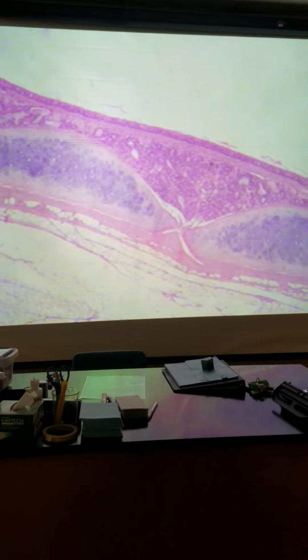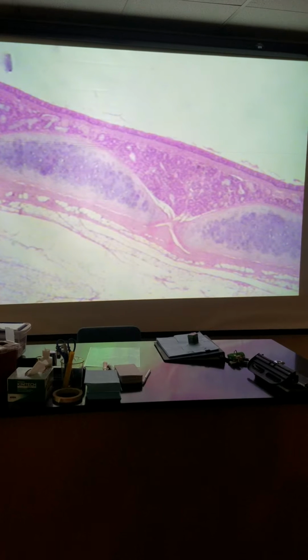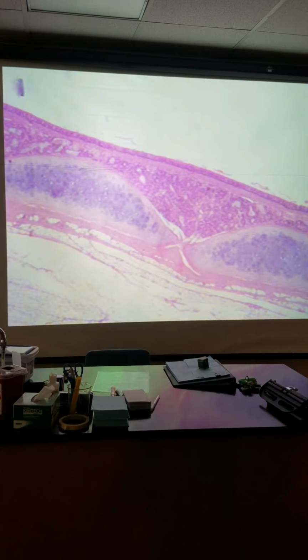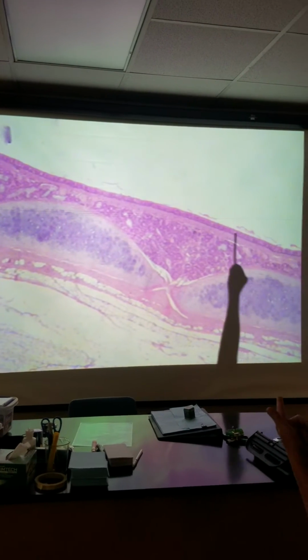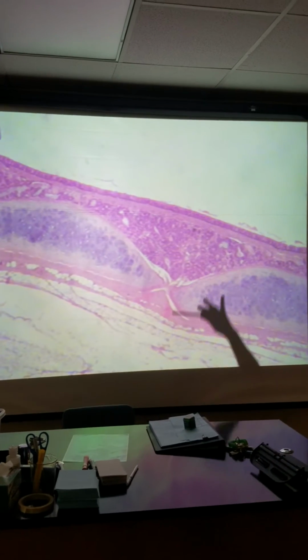This slide is from the trachea. We have 4 layers to the trachea, right? We have the mucosa, submucosa, hyaline cartilage, and adventitia. So this is on scanning on my microscope. This layer here that is intimate with the lumen of the trachea would be the mucosa. And I'm going to magnify this in just a moment, but this way you can see all the layers.